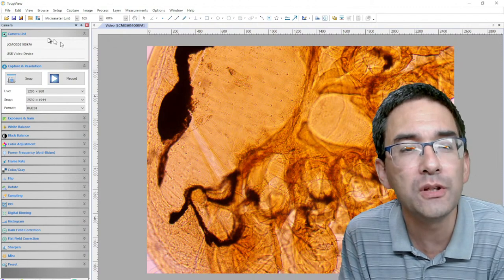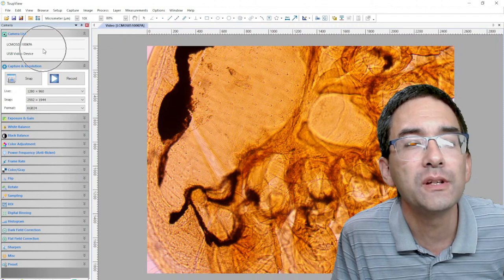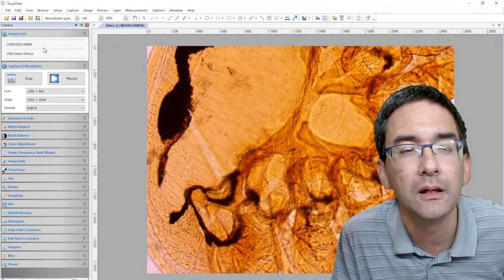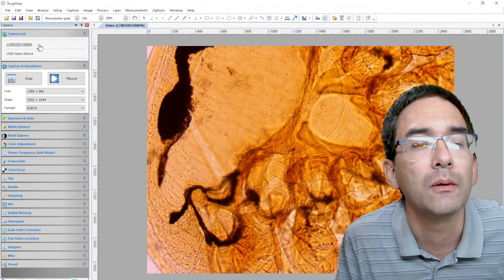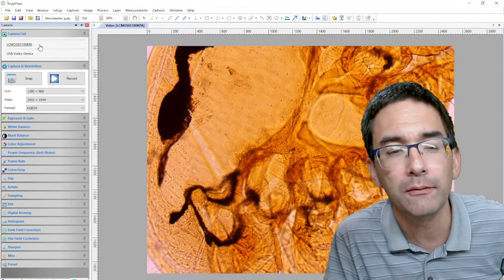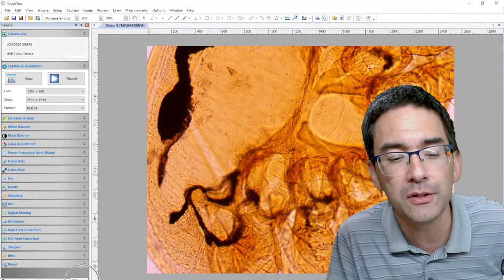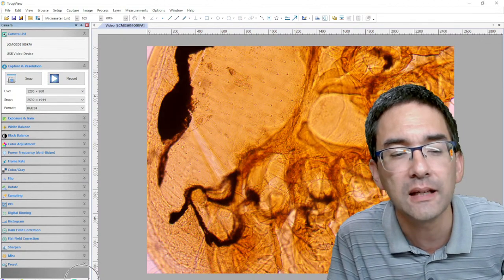But what is very important here is here in the corner, I have to see over here. What you see over here is the cameras that you've connected. Okay. And in my case, this is a camera. It's a 5 megapixel camera that I've connected. And what I found out is that depending on the camera that you have, you might get different menus over here. And there are different tabs down here. And what you have to have is you have to have the camera tab, okay, selected.